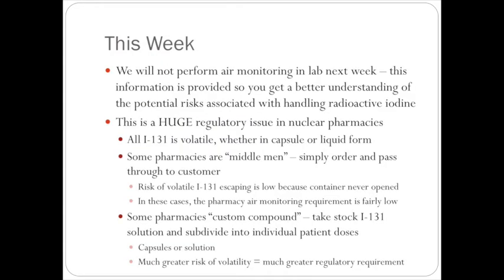So like I said, you're not going to do this. It's just kind of an FYI. This is one of the things that we do. Some people get a little iffy about doing radioactive iodine. If you know what you're doing and you know how your equipment is working, there is absolutely nothing to worry about in terms of handling radioactive iodine. But it is good to know the kind of procedures and processes that we put into place.